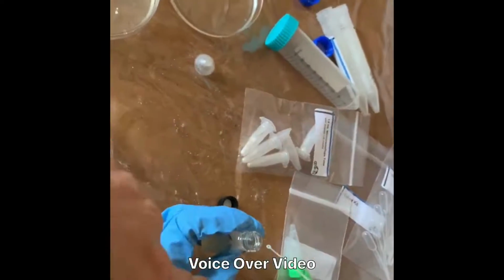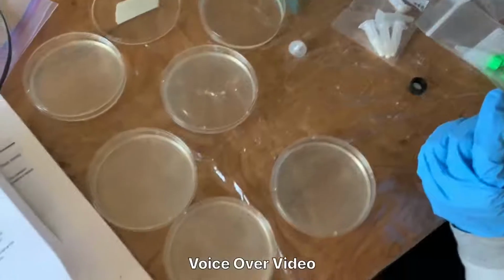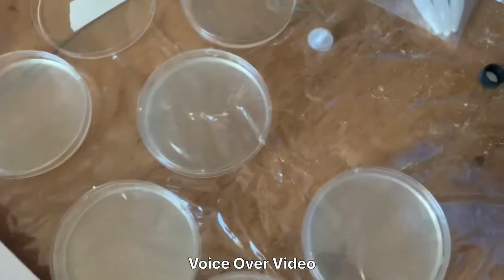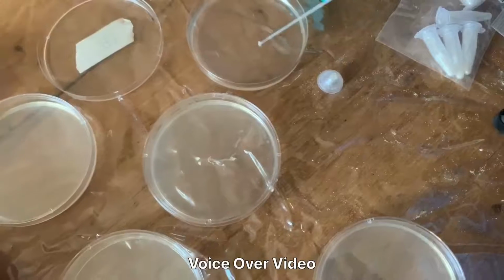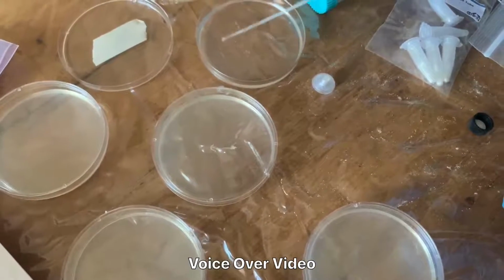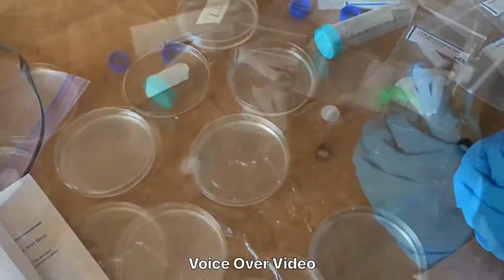Okay, so I came back and I took some of the E. coli with the little loop, and I spread it across the LB only, not amp, sorry. And I spread it across. After I was done spreading that one, I actually went in and did the other one because I had 2 plates.